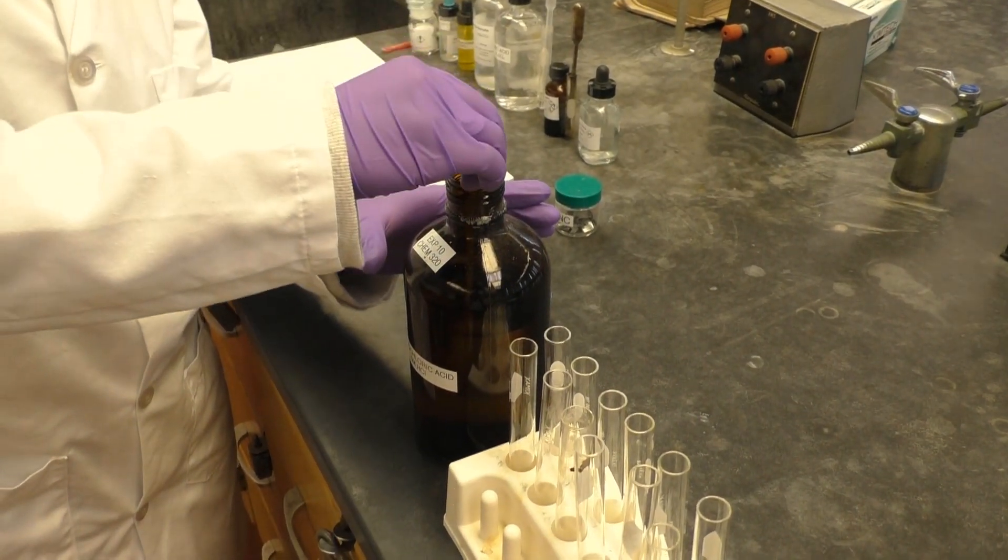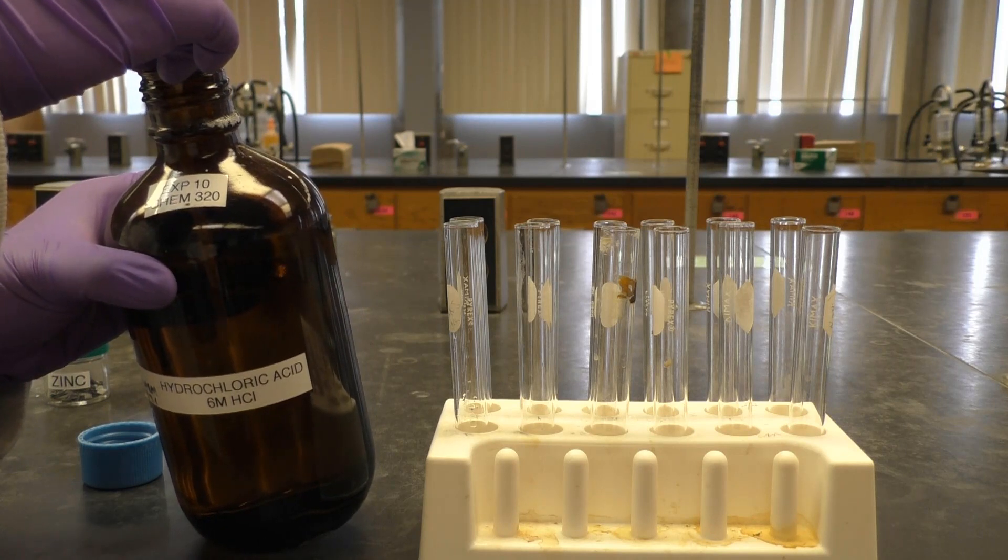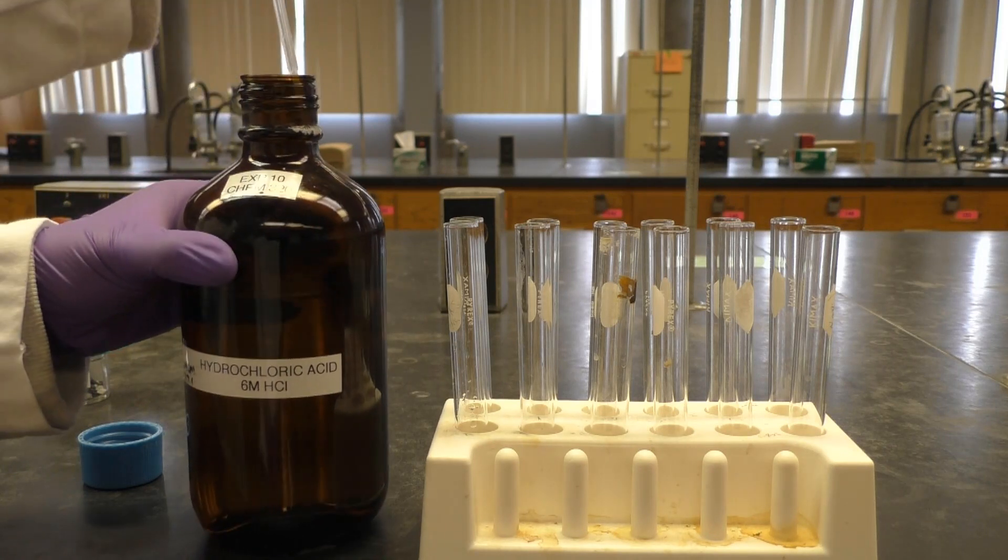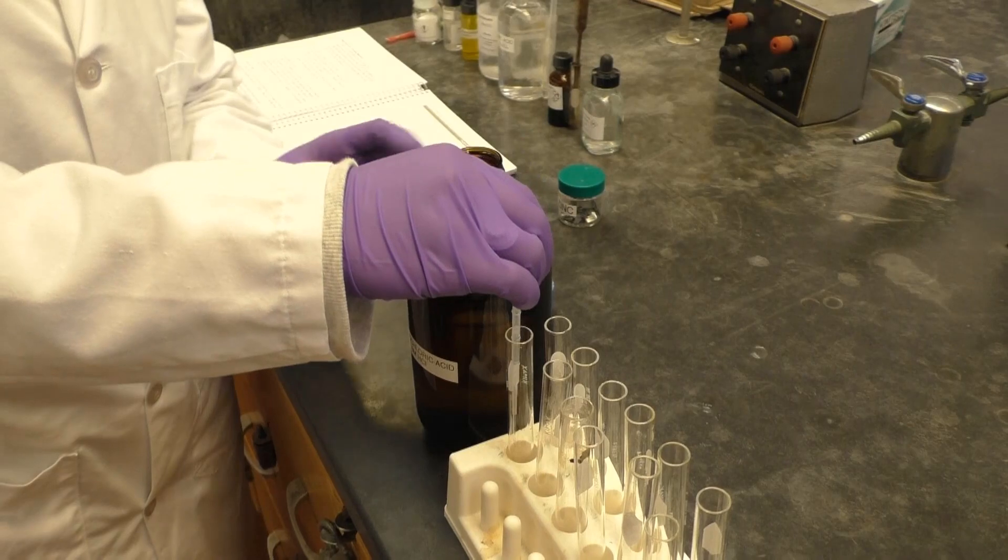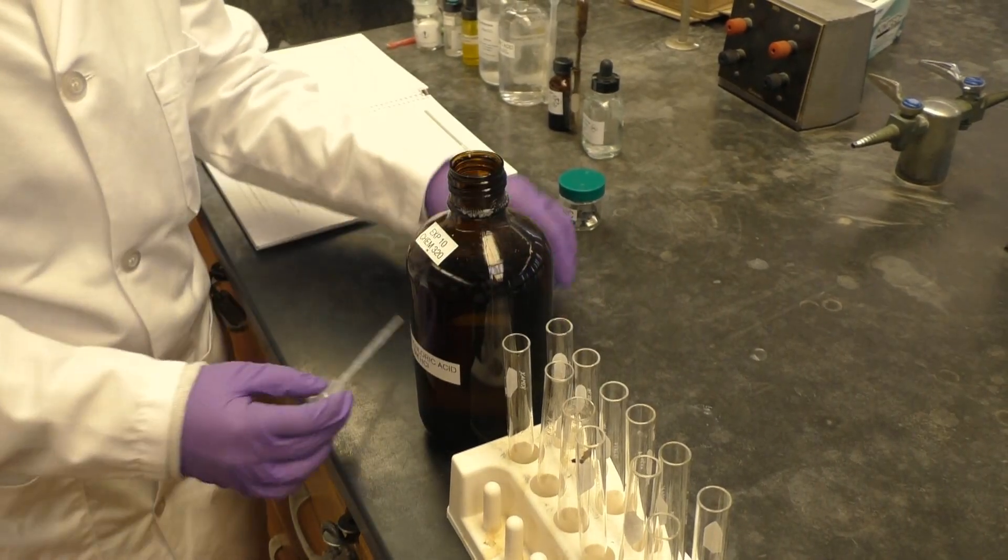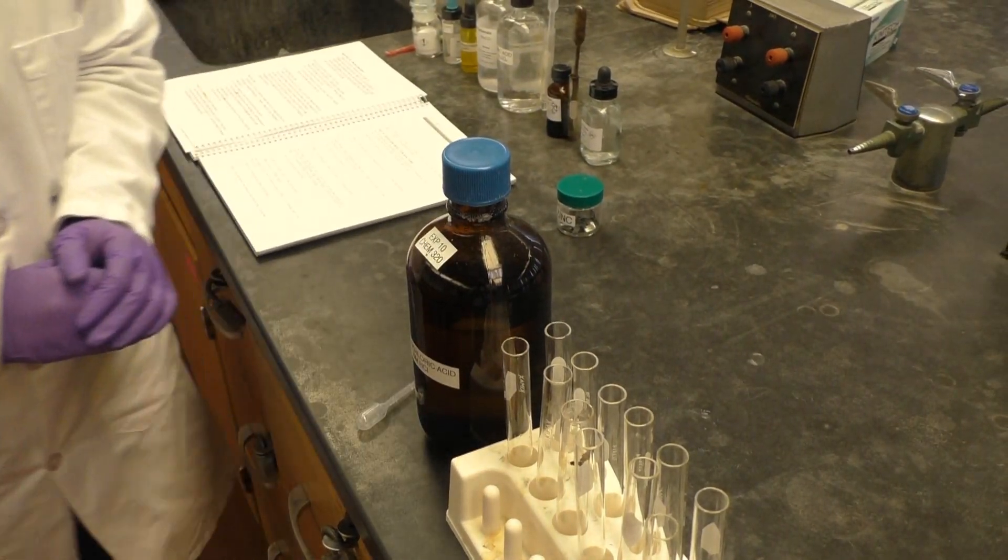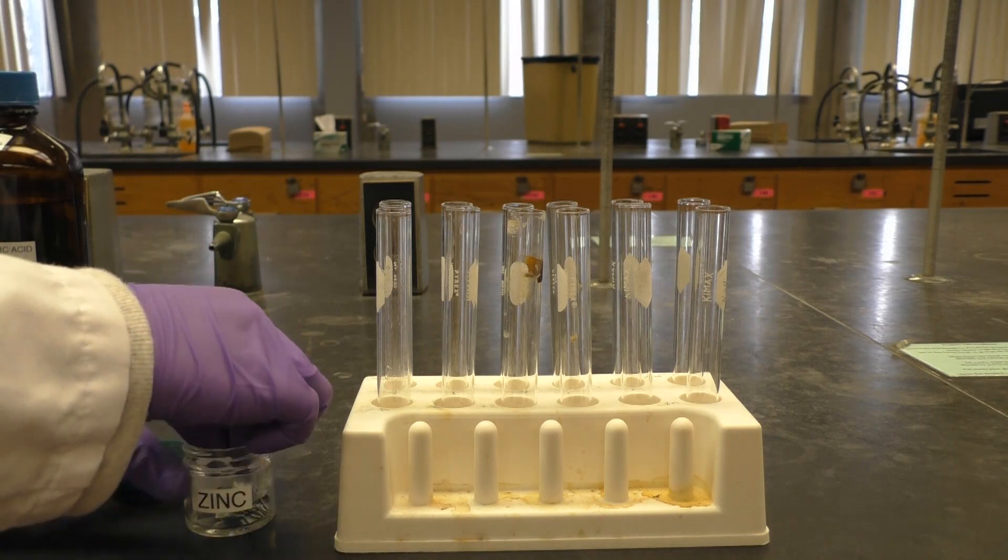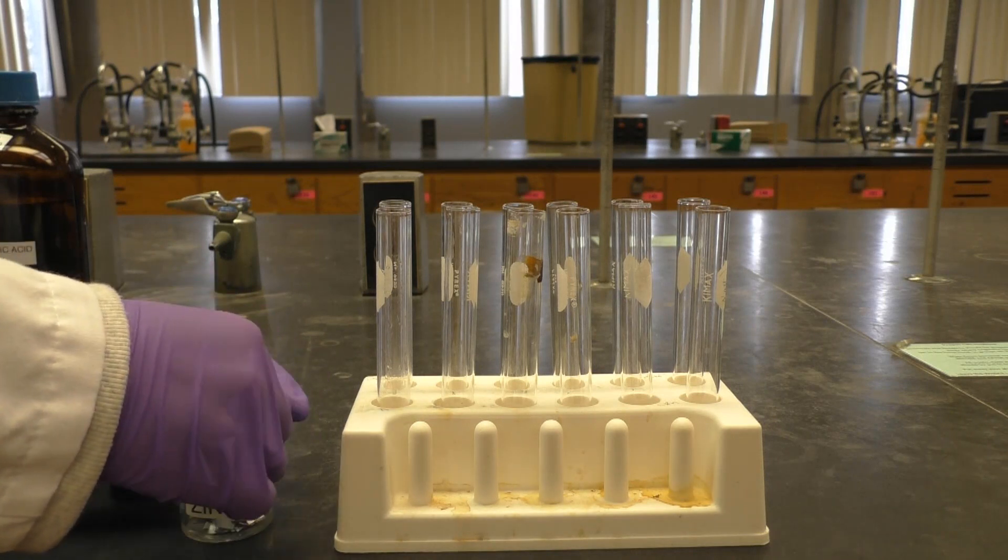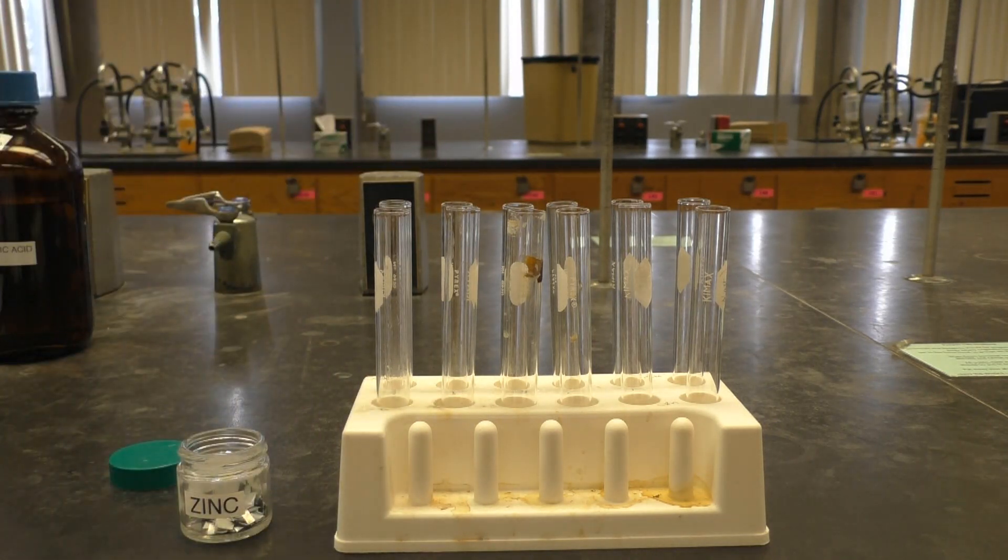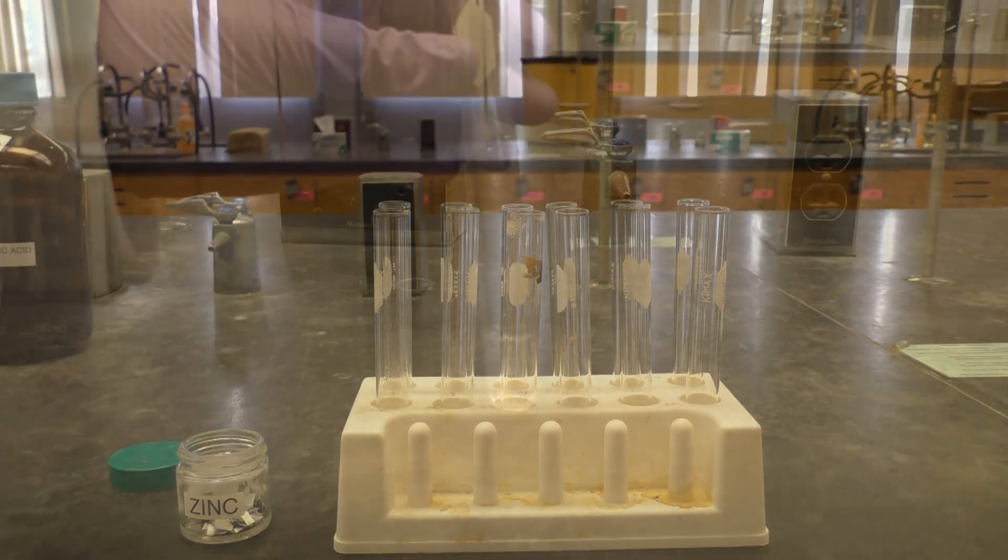So you don't need to measure out this amount, just add two pipetfuls. Then just add a small piece of zinc to your hydrochloric acid and carefully watch what happens. Be sure to record all observations in your notebook.